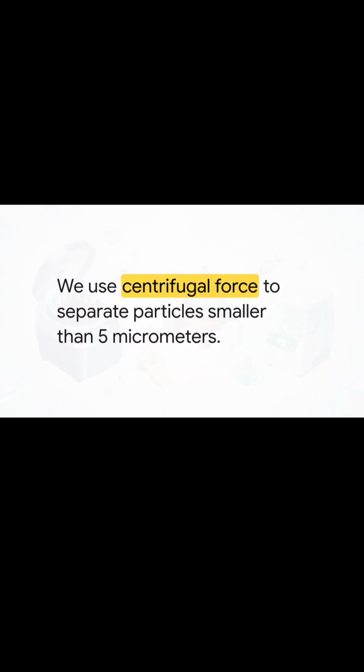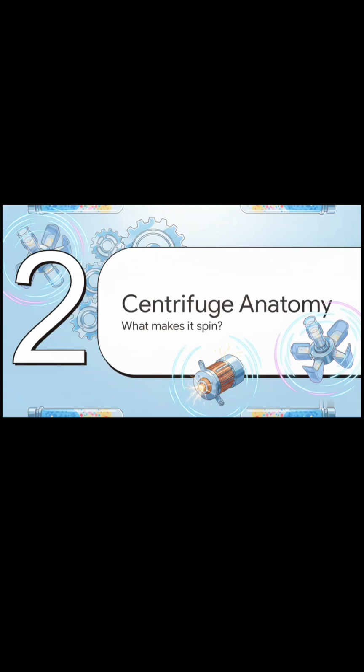Because they won't just sediment under normal gravity, we have to introduce a massive centrifugal field to finally overpower that motion and push those heavy elements to the outside. Moving on to Section 2, anatomy of a centrifuge, what makes it spin?